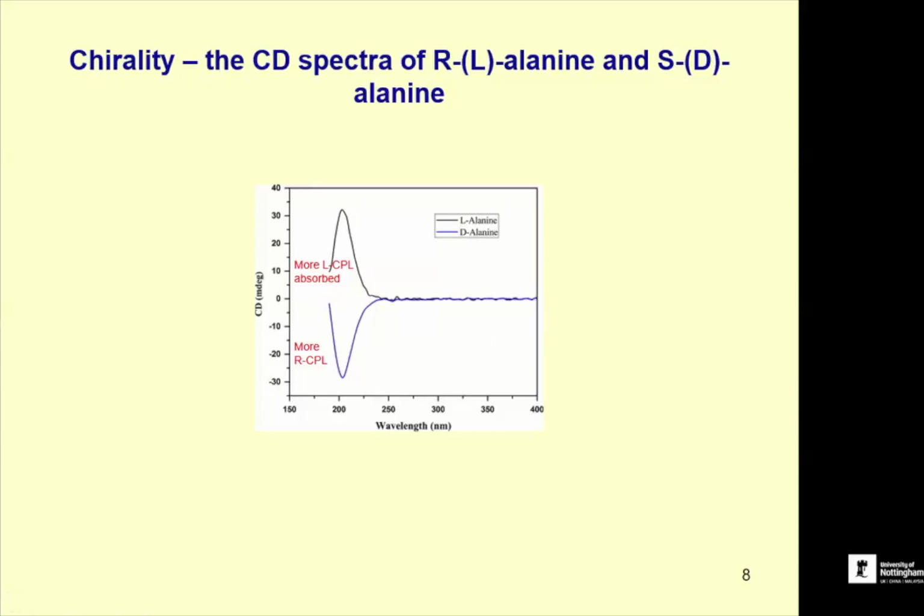Drugs can be isomer specific, and one isomer will work and the other one won't. So CD is an excellent way to pick out the right isomer in a mix, a racemate mix.